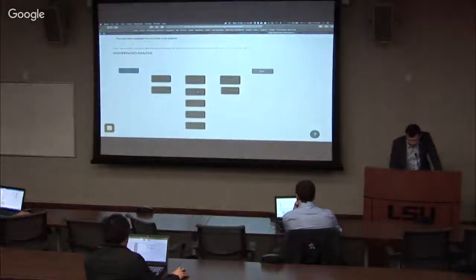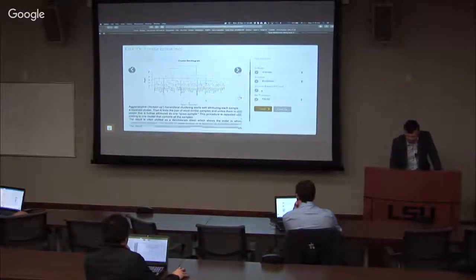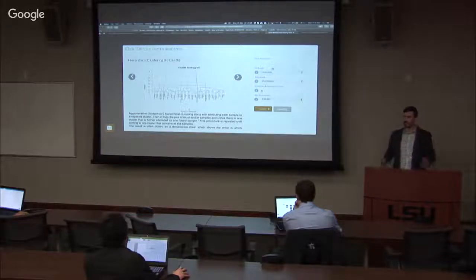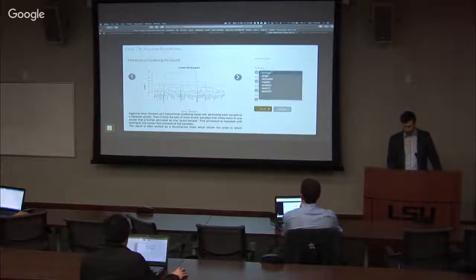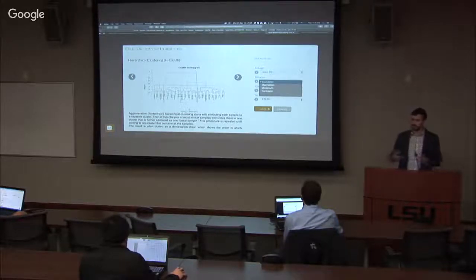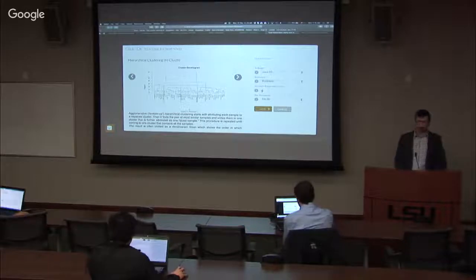And we can select hierarchical clustering. In a little bit, I'll explain what exactly it does. You can also read about it right here. You have several parameters. You have linkage, which is how these samples are going to be linked into clusters. For example, you can use WARD-D2, which is a good method for this type of data. You also have different ways to measure differences between the clusters because they have to separate into well-defined groups, so we can keep it at Euclidean. And the number of clusters, I will expect three.